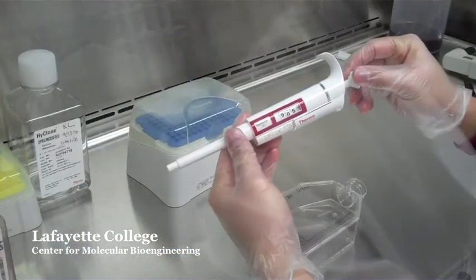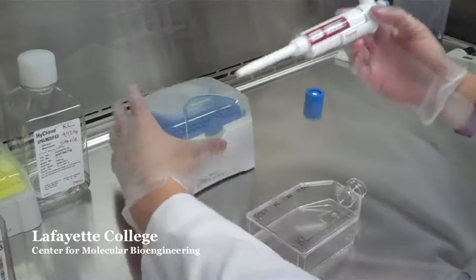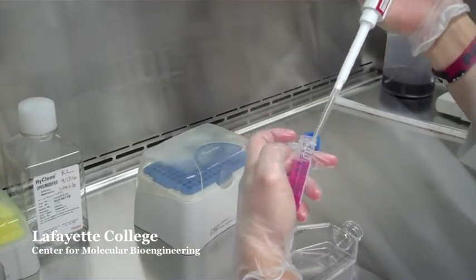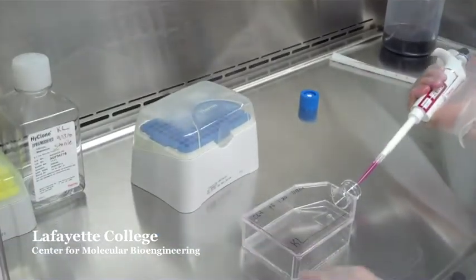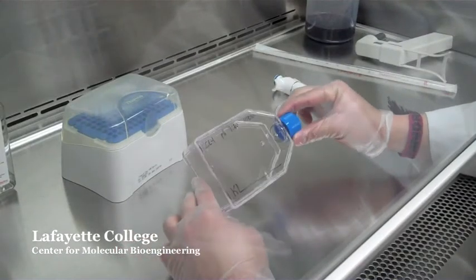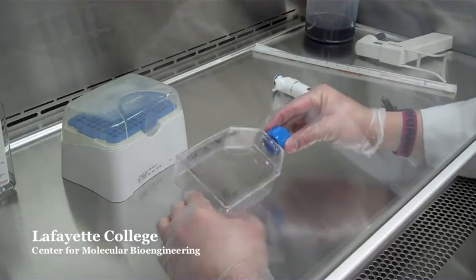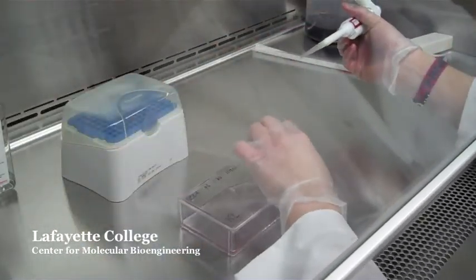Take the 1000 microliter pipette and adjust it to the desired volume of 1000 microliters. Carefully aspirate 1000 microliters of trypsin and put it into the flask. Swirl the trypsin to completely cover the flask, rocking the flask to do so. After all of the cells have been covered with trypsin, remove the trypsin from the flask with a pipette and discard in the waste beaker.